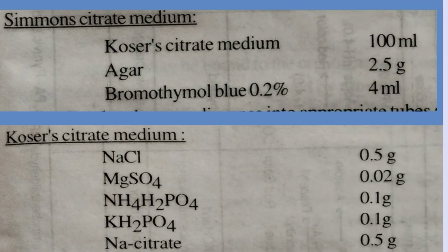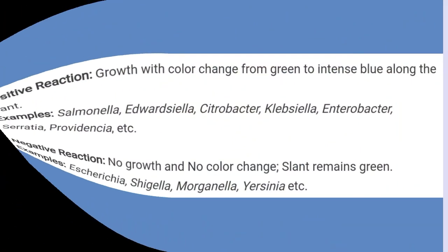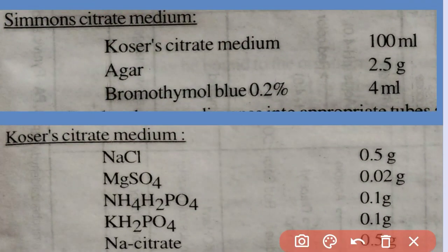This is the composition for Simmons citrate medium and Koser's citrate medium. The Koser's citrate medium modified for Simmons citrate medium.